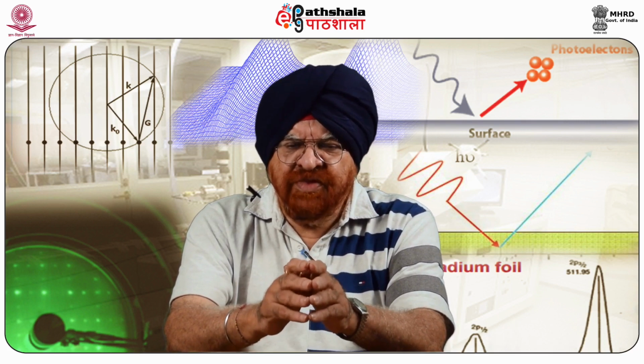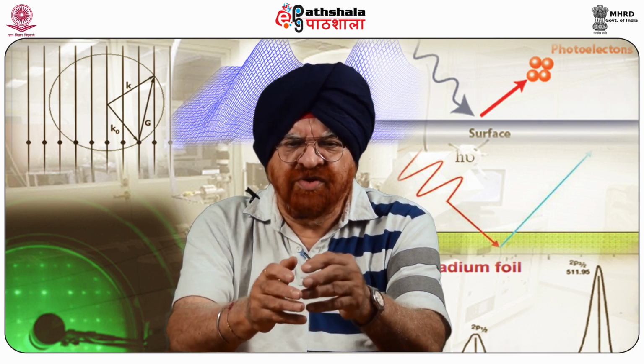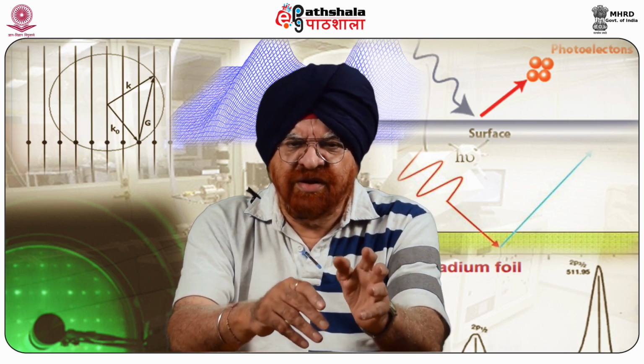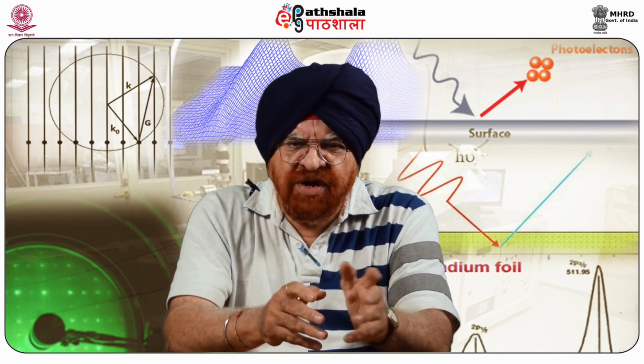In AFM, we utilize two types: one is a contact mode and the other is non-contact mode. Here we have a similar kind, but we call them frequency modulated and amplitude modulated (AM) types of microscopy.